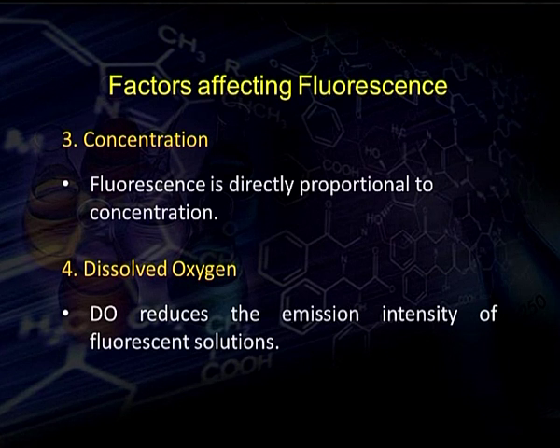The third factor is the concentration. Fluorescence is directly proportional to concentration. A more concentrated solution will show more fluorescence, and a dilute solution will show less fluorescence.